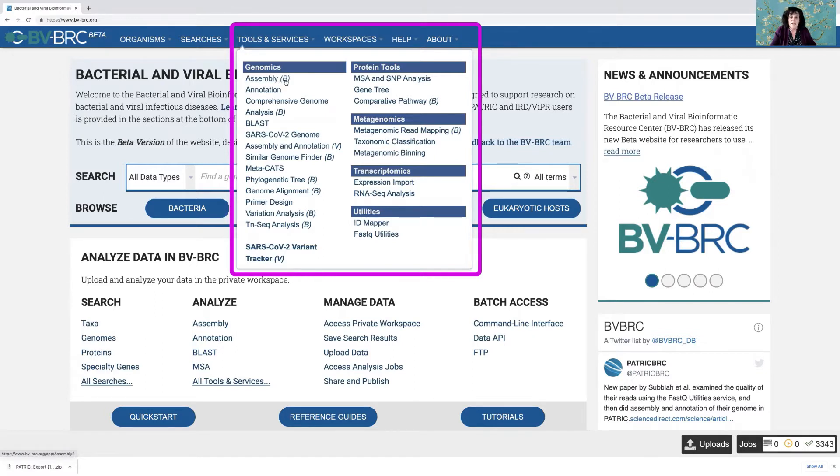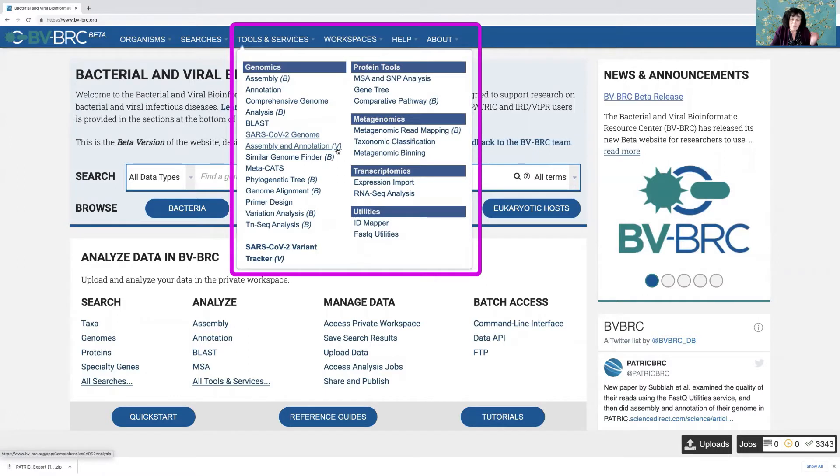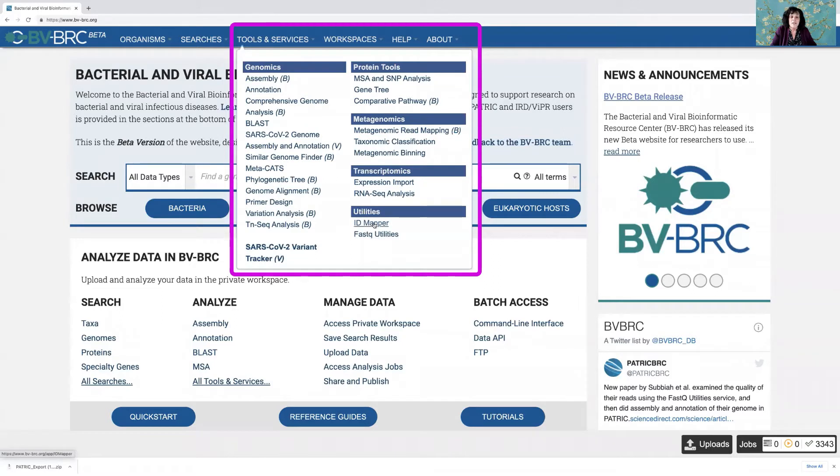If something ends in a B, that means it's for bacteria only. If it ends in a V, that means right now it's limited to viruses. And if it doesn't have anything after it, that means that you can use it with both bacterial or viral data.